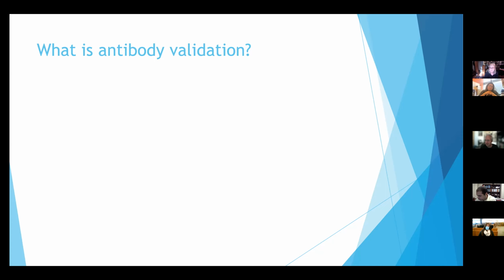No, you can't. To the best of my knowledge, the only way you can really do it is through a structural approach. At this point in time, I'm not quite sure people are doing X-ray crystallography that well or that much. Cryo-EM is probably the way you can do it. There's supposed to be a way where you actually have the complex and then modify the protein around it. If someone really wants to know, I'll go and find out. But that doesn't give you the three-dimensional surface. That just tells you the amino acids that are involved. But to get the structure, you actually have to do cryo-EM or X-ray crystallography. And normally there's about 3 to 5 amino acids that are key for the binding. It will cover about 12 to 15, but 3 to 5 are usually the key amino acids. If you change the others, you'll probably just change the affinity a little bit.